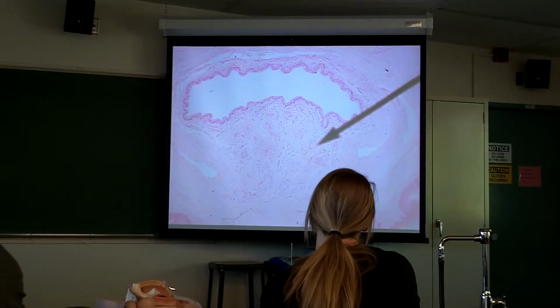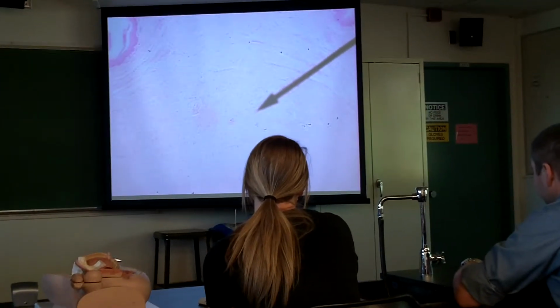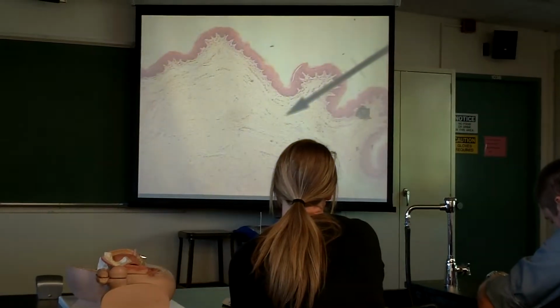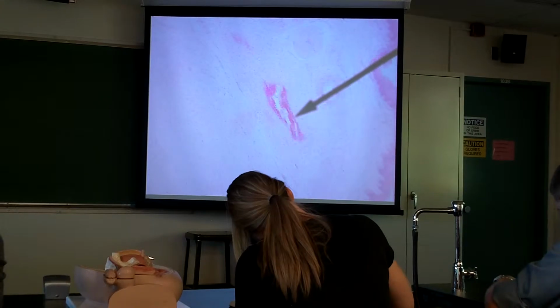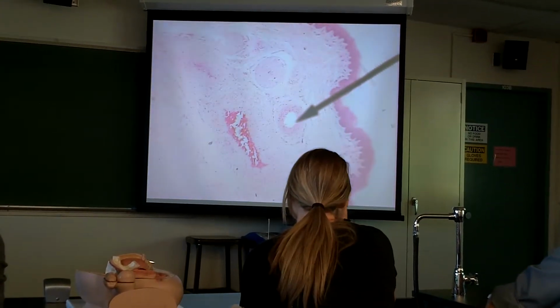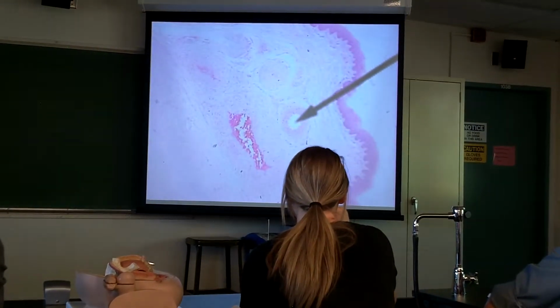Questions so far? So that must mean this is the ventral side of the penis. So if we go to the other side, this must be the dorsal side of the penis up here. So we should find some blood vessels somewhere up in here. Where are they? Oh, there's a couple. So here's what looks like probably a vein that's filled with blood still. Here's an artery that looks pretty empty. So those are a couple dorsal blood vessels.